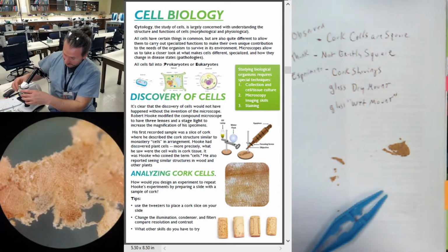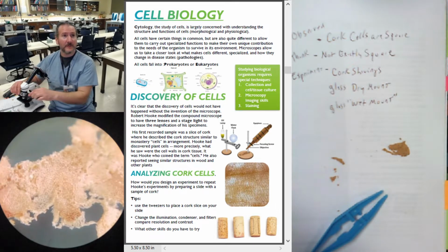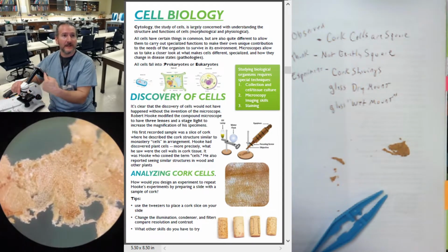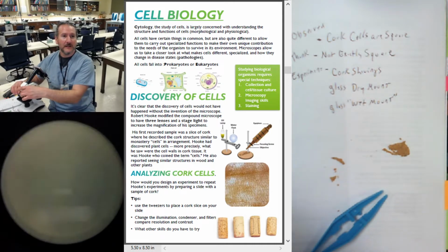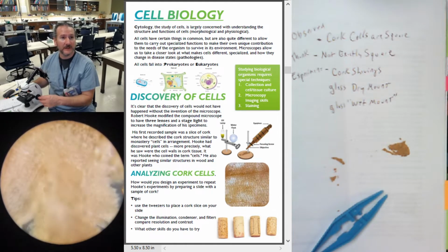Still see those cell structures. That's really cool. In fact, there are some places that are really thin, so I'm going from the scanning, 40 total magnification. Remember, 4 down here, 10 up here. 4 times 10 is 40. I'm going to go to the low power. Just the fine knobs, remember? Oh, there it was. Awesome. Look at that.